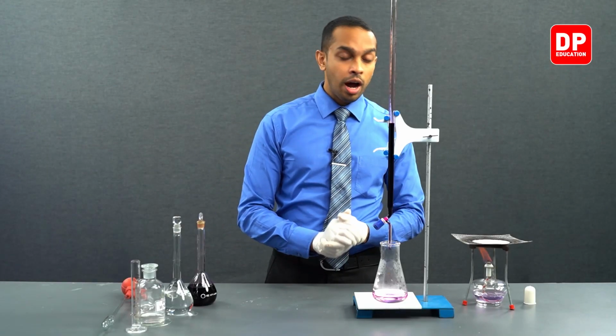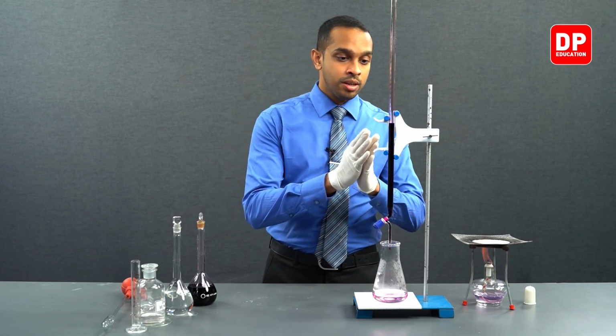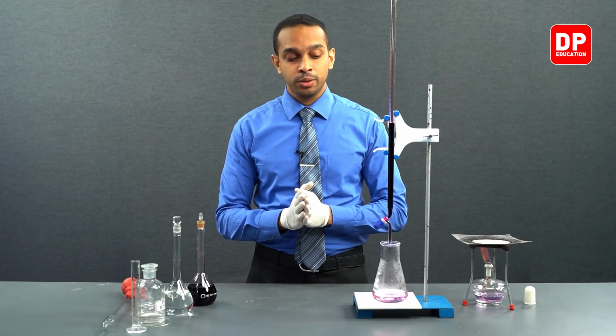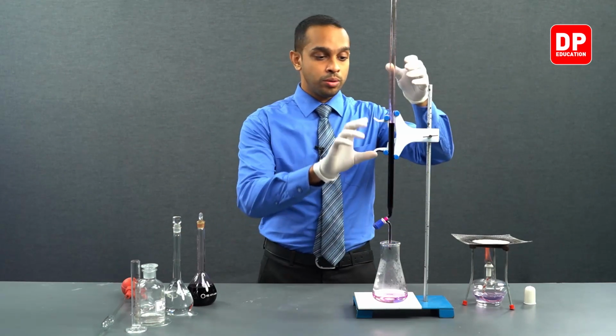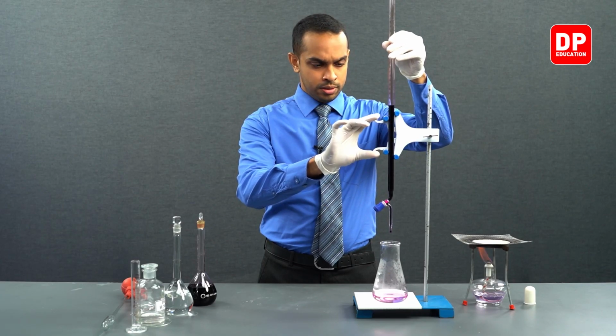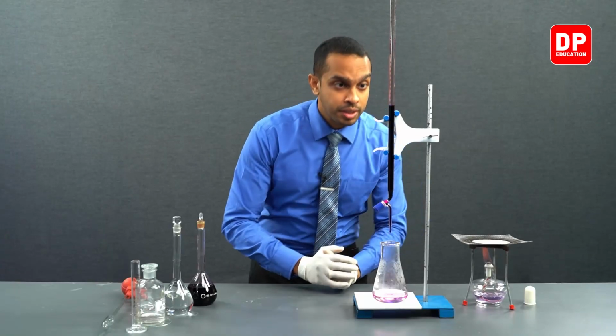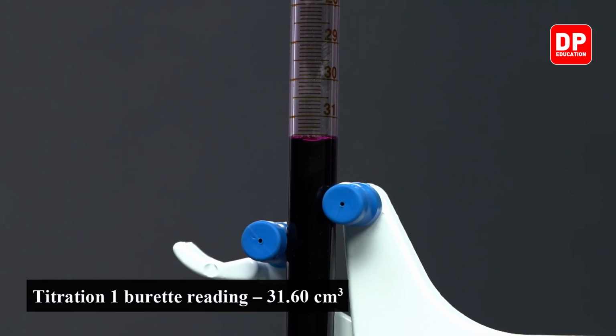So after obtaining our endpoint, we need to observe the reading of the burette. So let's go on and take a look at the reading of our burette. Our burette reading is at 31.6. So our first burette reading is at 31.6.